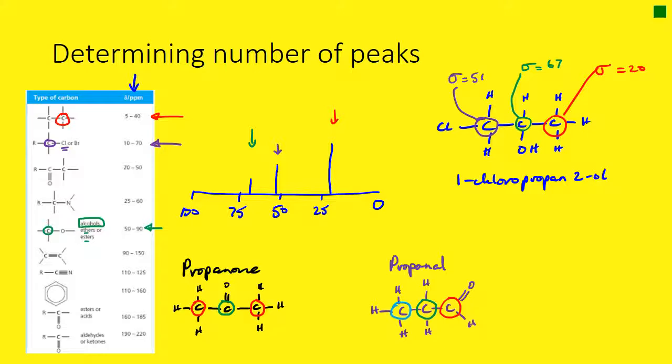Well, we've got a tiny bit more space there. Let's do benzene as well. So we'll quickly draw out benzene. Hexagonal, 6 carbons in a hexagon, with the delocalized electrons. You can see that this is a very symmetric molecule, and so all 6 carbon atoms are in the same environment, and so benzene will just make 1 peak, as would cyclohexane. Cyclohexane is symmetrical in the same way as benzene is, so that would be 1 peak.